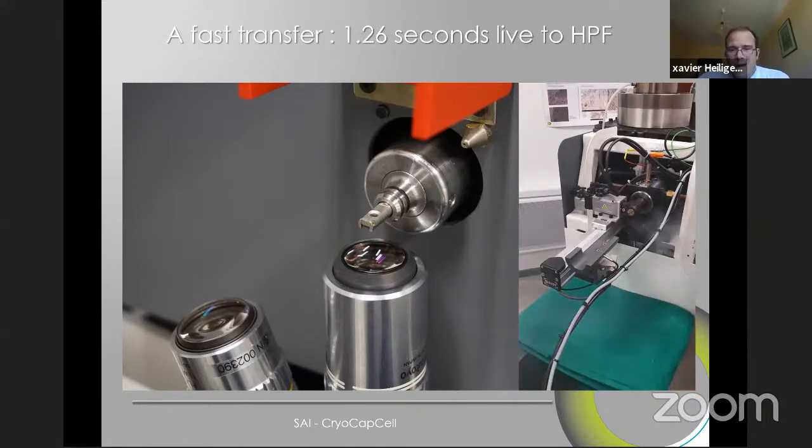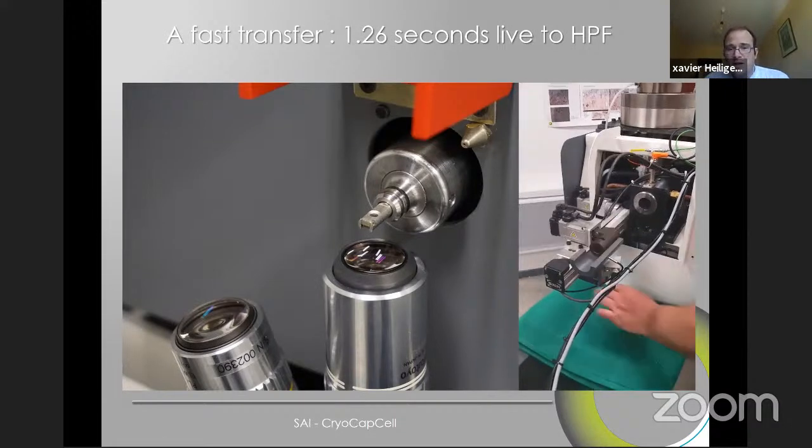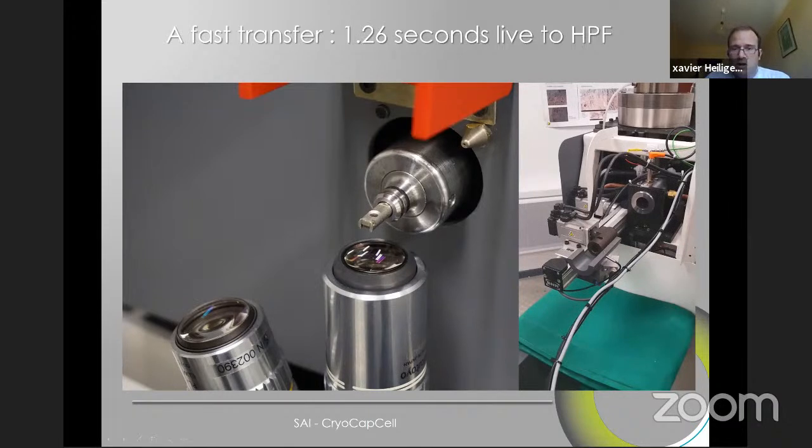So when we say we blast 2000 bars of liquid nitrogen on the sample, you've seen it, it's literally blasting 2000 bars of liquid nitrogen. So we need to protect the sample. And that's one of the key problems in HPF, is to avoid blasting the sample and make sure that you vitrify it.